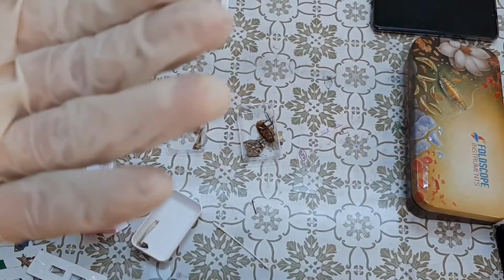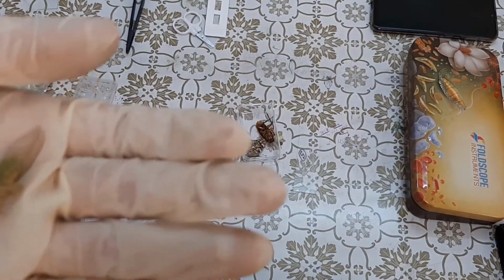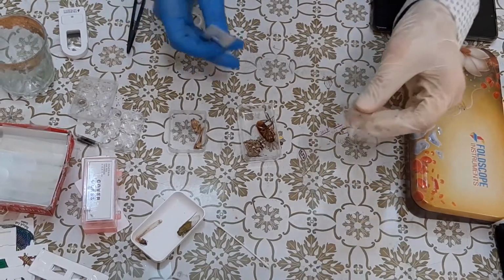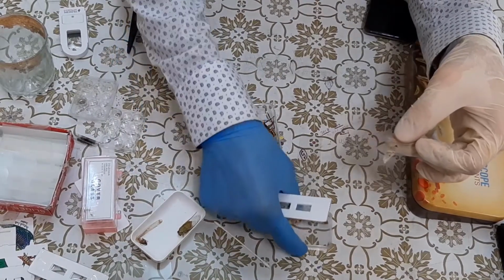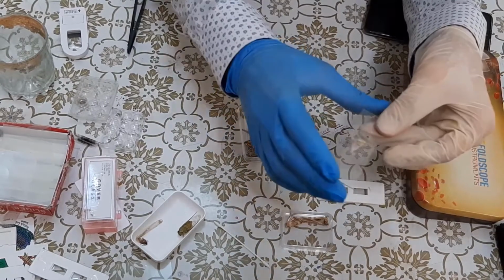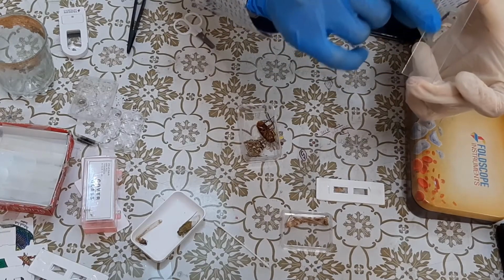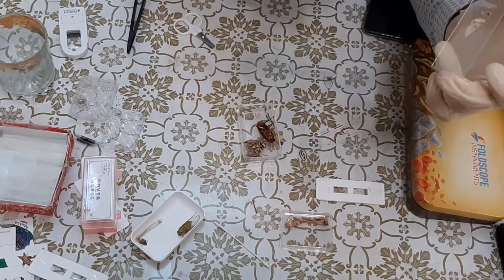So let's stop here for now and move on to prepare the slides. I'm going to leave this one to the last. Now I'm going to start with these two samples, from the grasshopper and the moth, that I have already prepared. As always, we have the slide, and I put the sample here. It's the wing, and then a piece of tape above it.